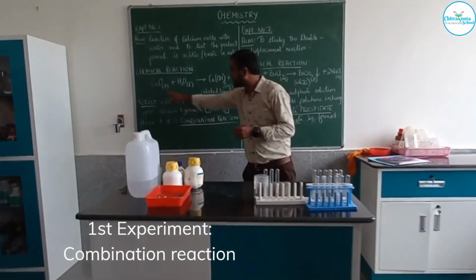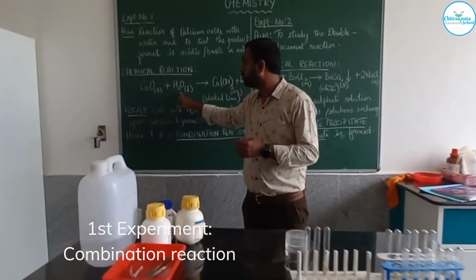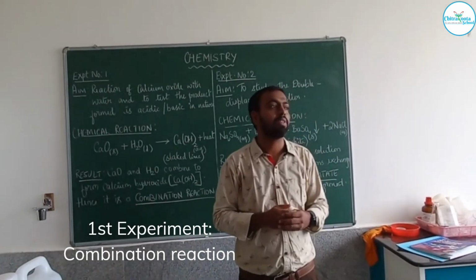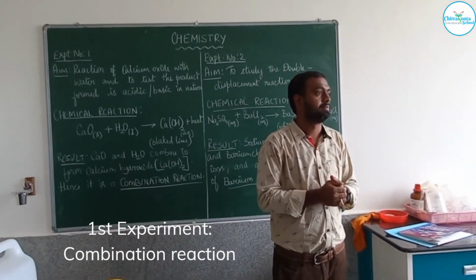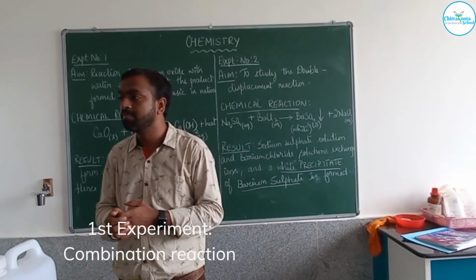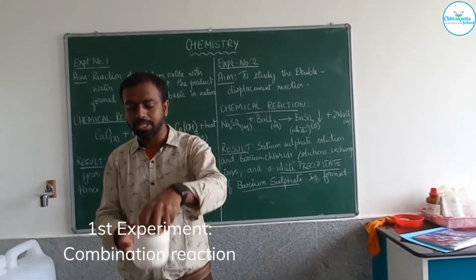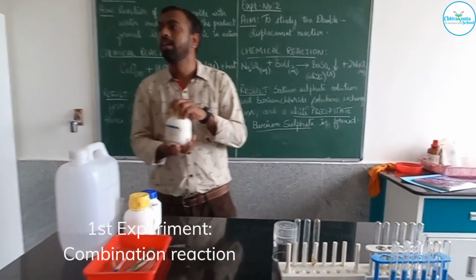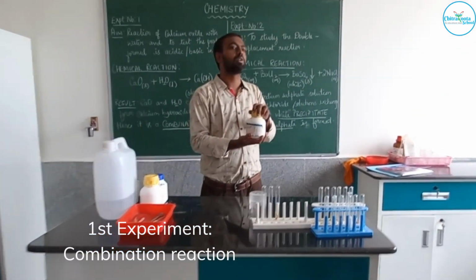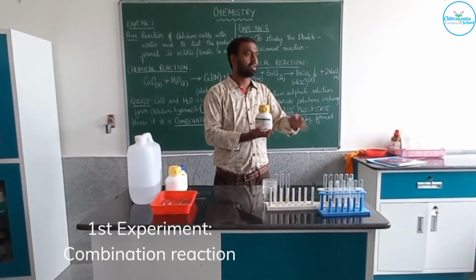Now, if you pour water on calcium oxide, how will you identify the difference between the two? Is it possible for us to identify? Just calcium oxide is a solid substance. The solution of calcium oxide we call calcium hydroxide. Simple, common names we know.